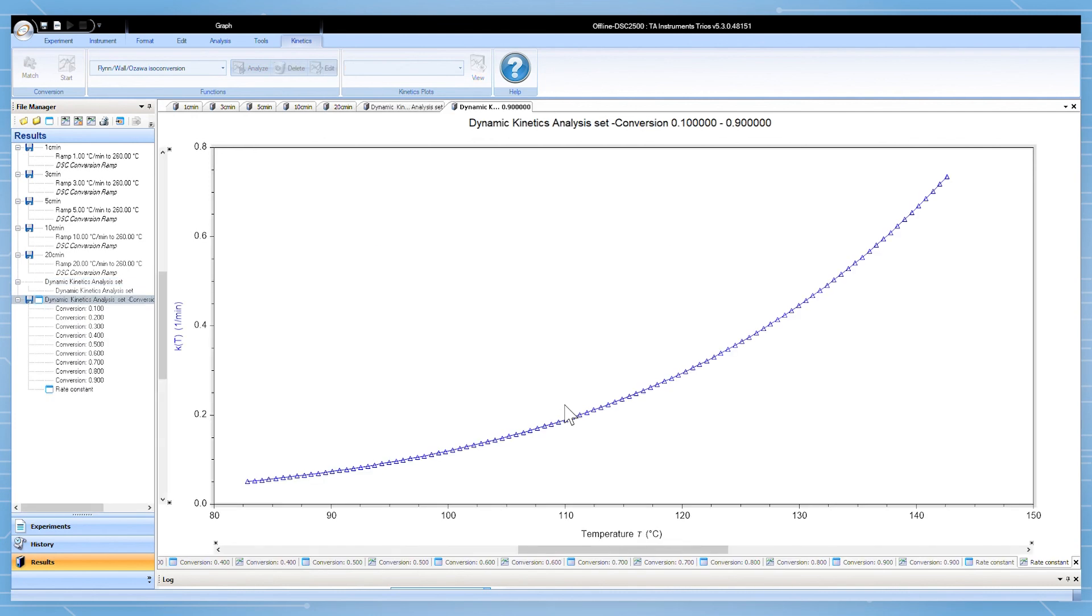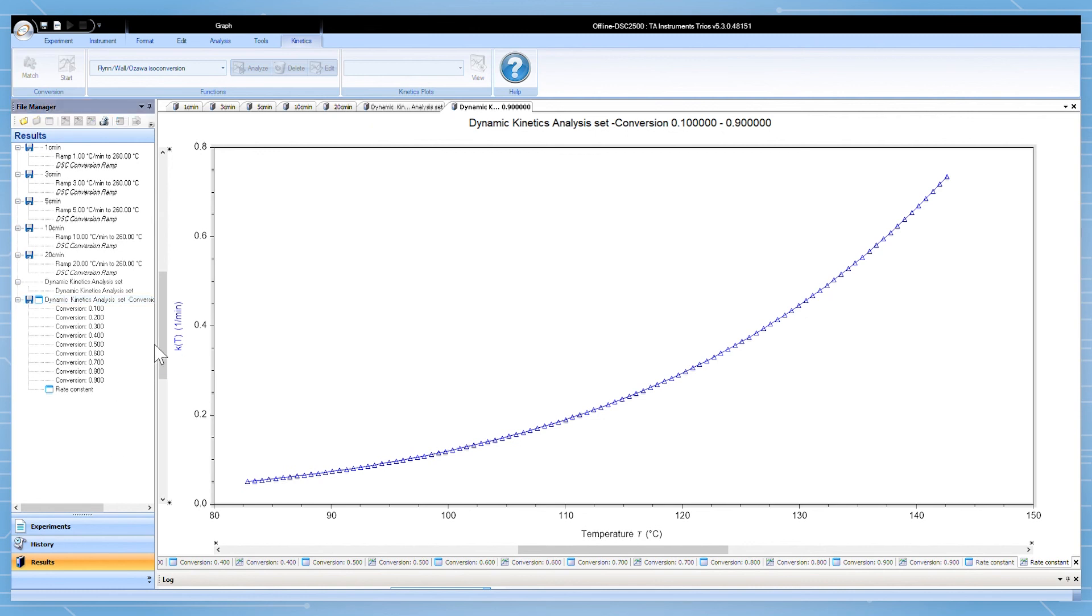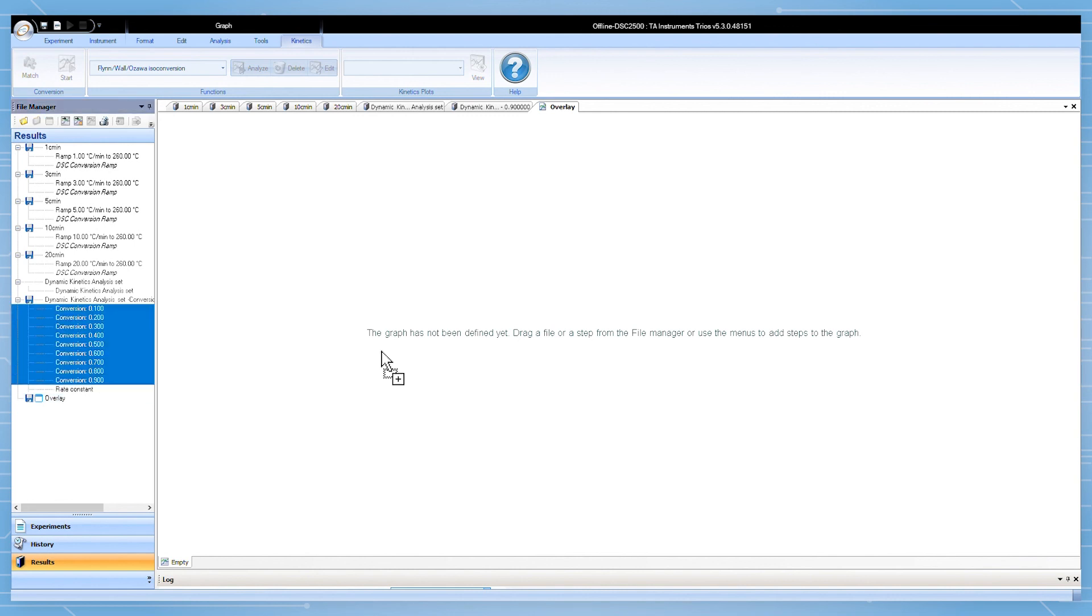You can plot these in an overlay by right-clicking on the left side and selecting new overlay document. Drag the individual graphs on the new overlay to compare the predictive curves.